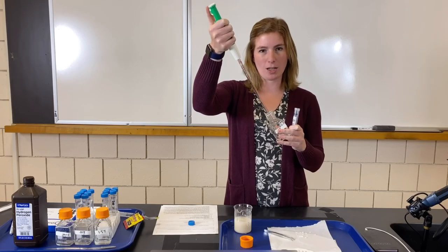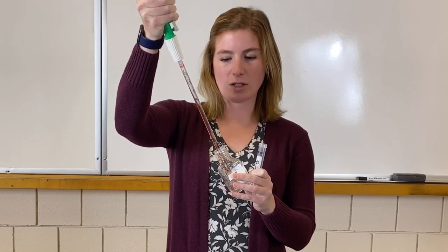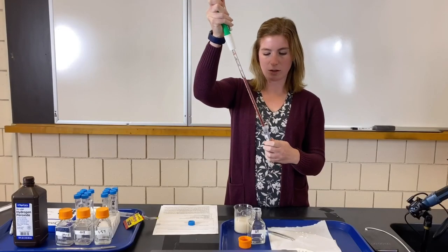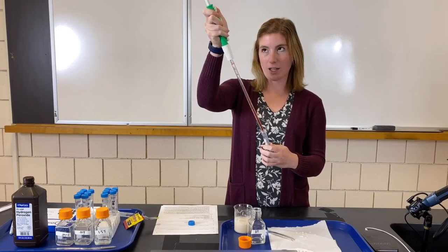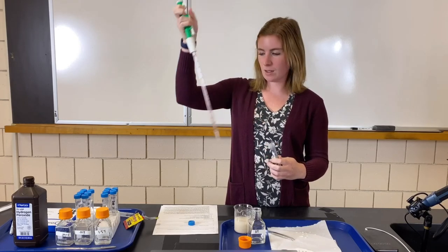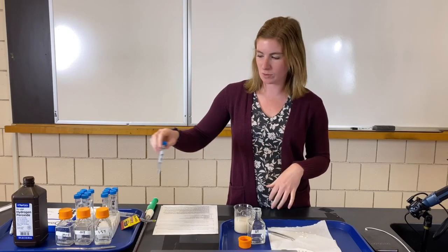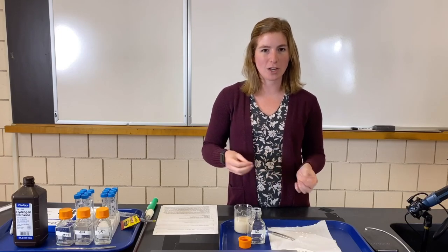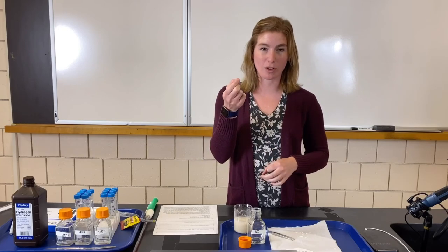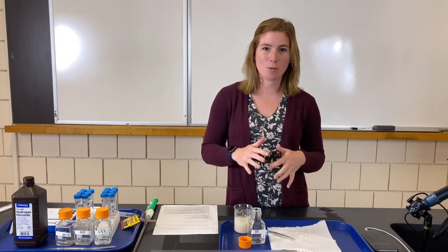I put the pipette into the solution and twist the knob up top to suck up the liquid, drawing up 10 milliliters. Then I scroll the circle the opposite direction to dispense it into the test tube. This is how you measure precise amounts in class. For this lab the exact volume didn't critically matter, but consistency is essential — we're timing how long the filter paper takes to rise, so if we had different liquid levels the times couldn't be fairly compared. All test tubes have the same amount.